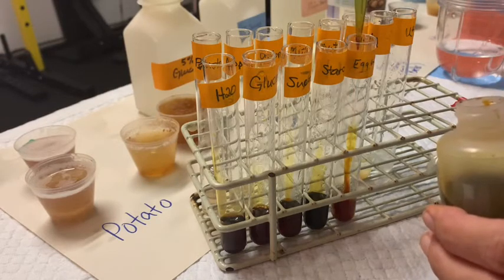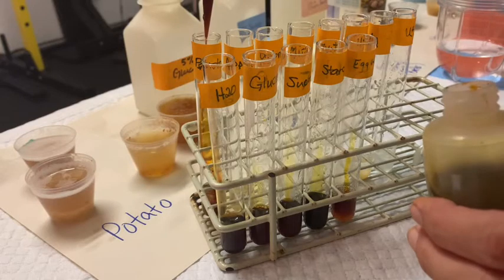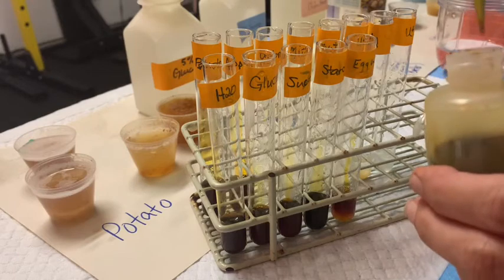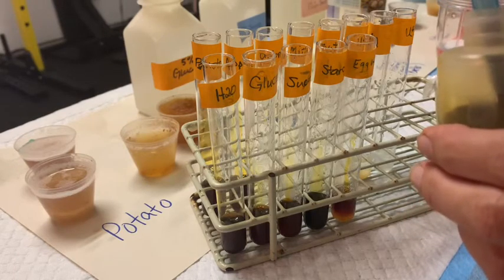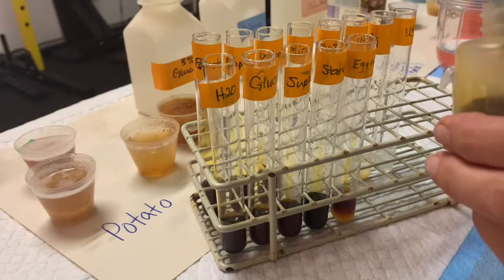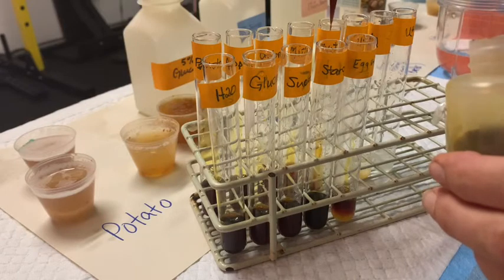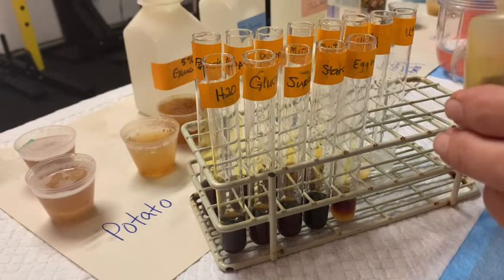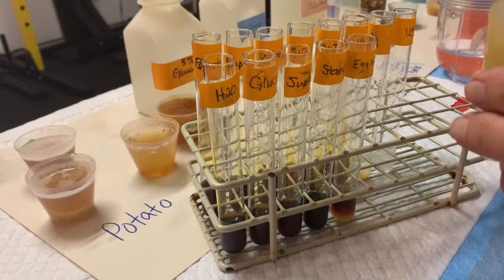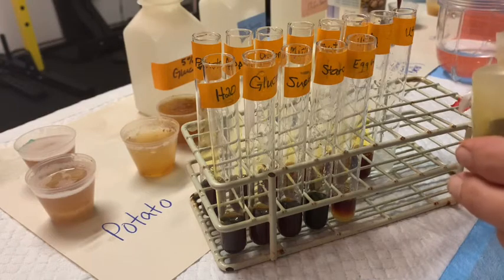It's a pretty instant reaction, which is nice. There are our controls, and we're going to keep going down the line — potato, apple, onion, milk, our peanut butter, and our three unknowns. Then we'll compare them against the positive and the negatives.